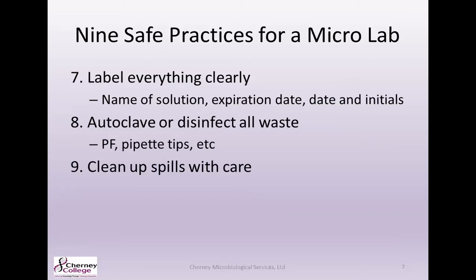You're also going to want to make sure that you label everything clearly, especially any solutions made in-house, acids, bases, even your sanitizer solution. You're going to want to make sure you have the name, the expiration date, the date of make, and the initials of the person who made it.